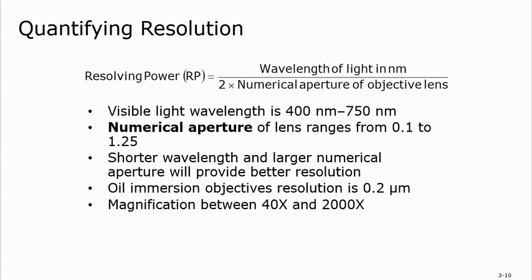Wavelength normally ranges from 400 to 750 nm. The numerical aperture of the lens — meaning how close the points are to each other — can range from 0.1 to 1.25, and every lens is different. The most important thing to know about getting good resolution is: short wavelength and large numerical aperture. Those are the two factors for resolution: number one, the wavelength; number two, the numerical aperture.